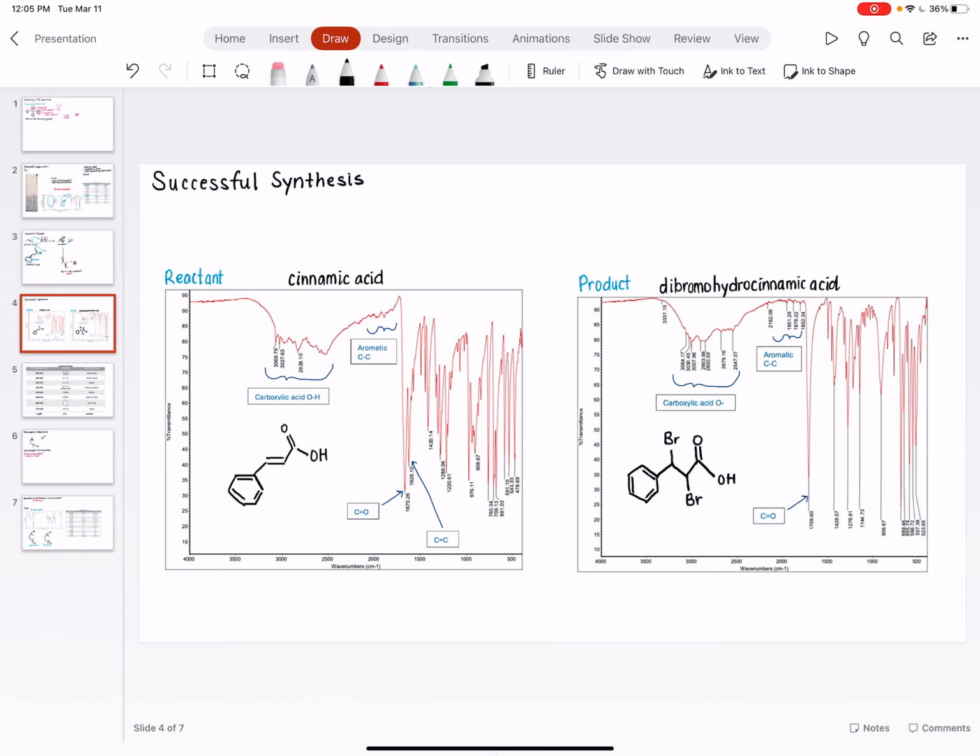In this video, we'll discuss the last question on the Alkene addition lab. Was your synthesis successful? Explain using FTIR and melting point data. So I'm going to focus on FTIR.